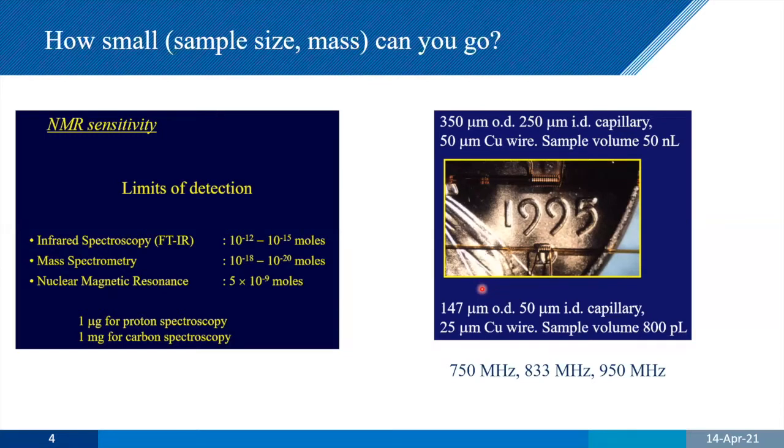And then, of course, if you're a high resolution NMR person, you know that you've got to be able to shim that to less than 1 hertz. And we know about susceptibility, right? You want copper right next to your sample. So it's not just a question of building this coil, you then have to do a lot of tricks to get high resolution spectra out.